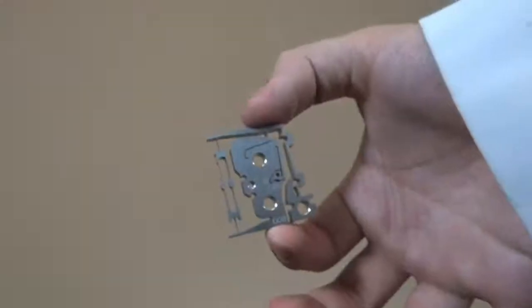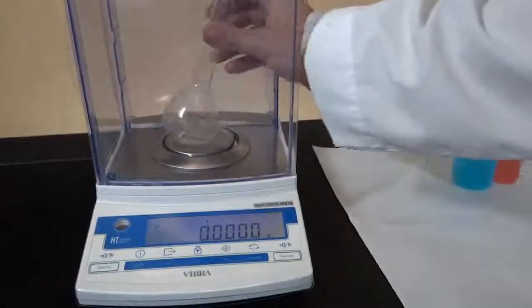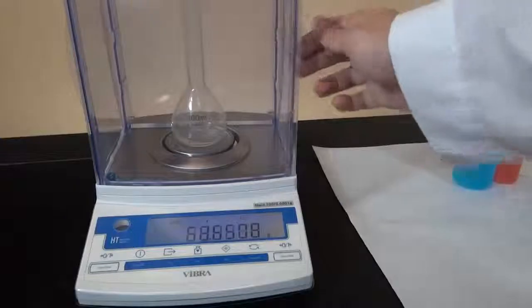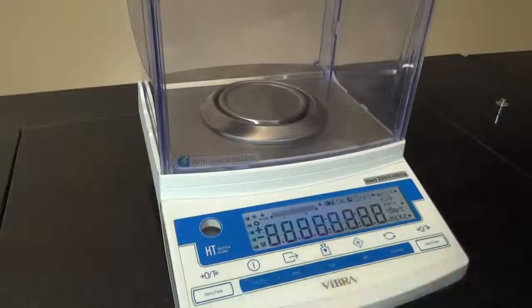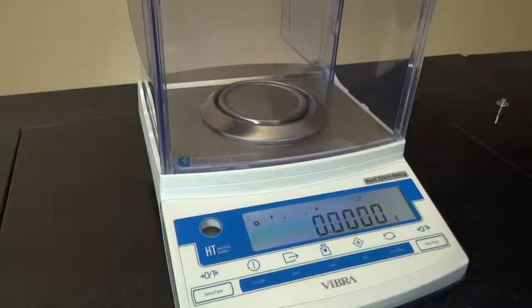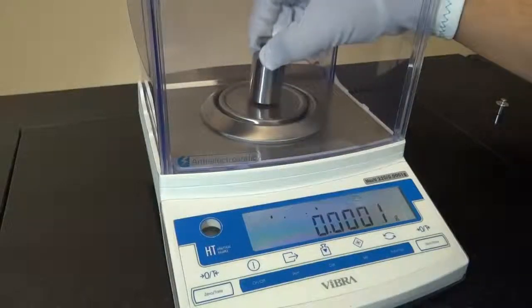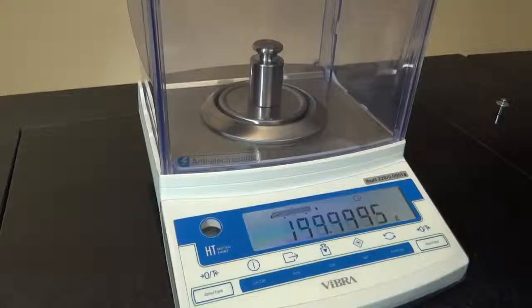The frame is exceptionally lightweight and sturdy, helping to protect the mechanism. Inside the HT is the Vibra Tuning Fork Sensor, protected and sealed by a steel casing. The Tuning Fork Sensor offers the user many advantages — it is extremely stable and is unaffected by temperature during balance warm-up, meaning the HT will provide its maximum performance and minimal drift immediately after turning on. There is no warm-up period.